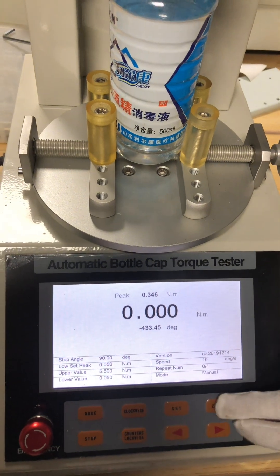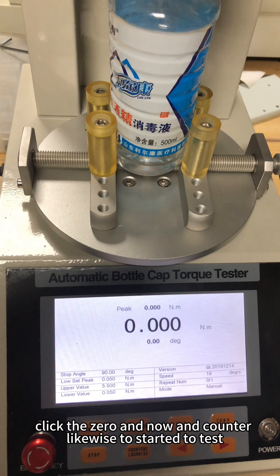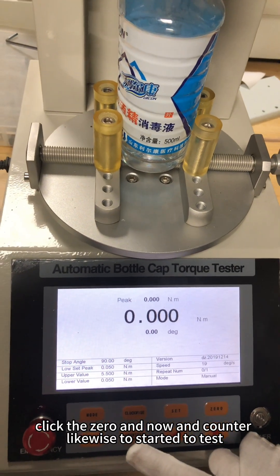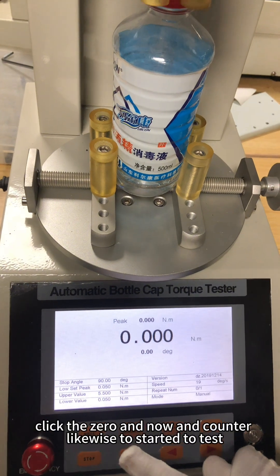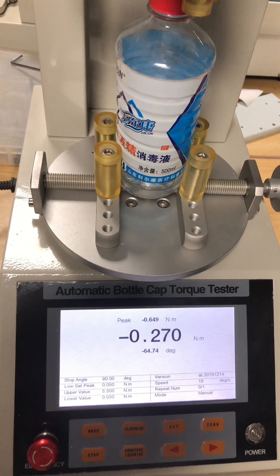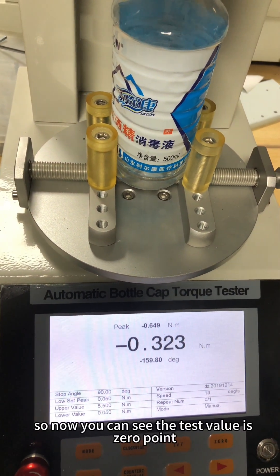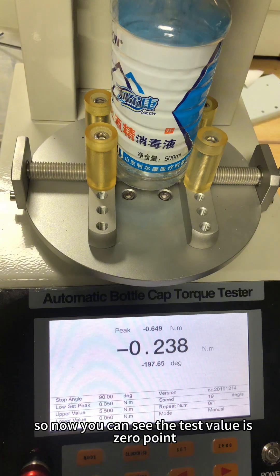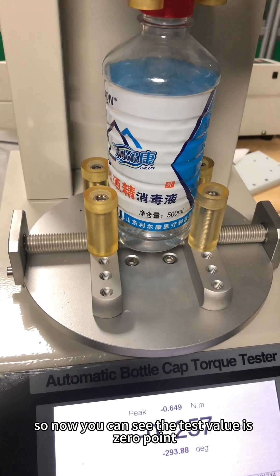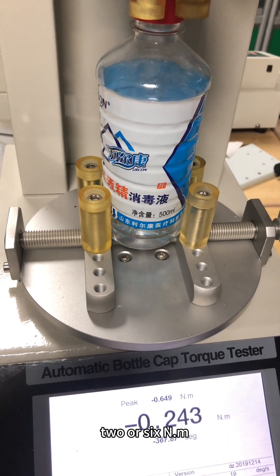Let me click zero, and now counter-clockwise to start the test. You can see the test value is 0.26 Newton-meter.